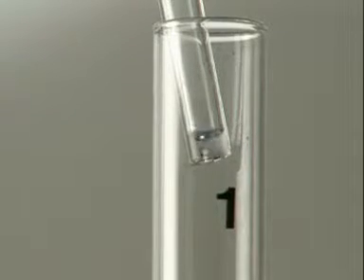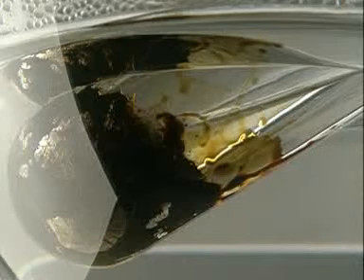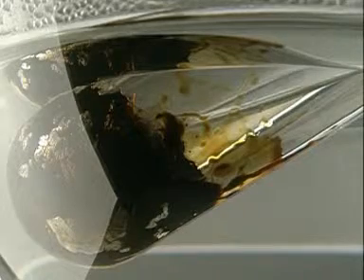The temperature stays at around 40 until all the hydrocarbons with this boiling point have vaporised. The hydrocarbons left behind aren't hot enough to vaporise. Their boiling points must be higher.